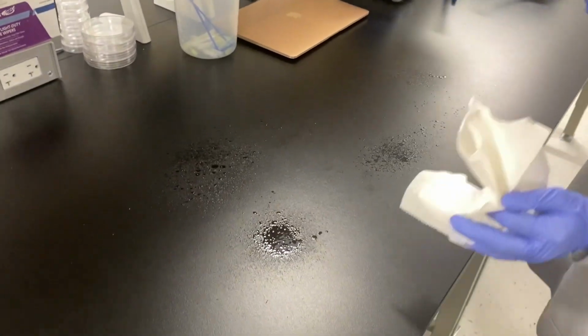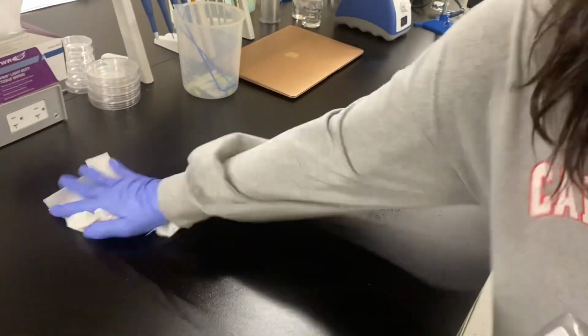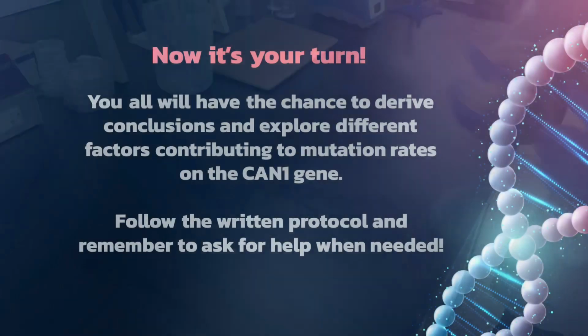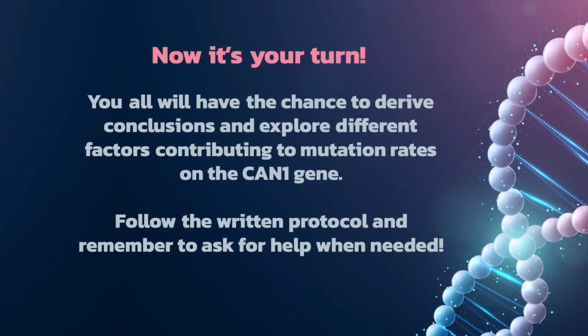Once you finish conducting any of your lab work, it's always important to clean up your lab station for the next person to use. Well done, now it's your turn. If performed successfully, you'll be able to make observations about mutation rates, derive conclusions, and explore different factors contributing to mutation rates on the CAN1 gene. Follow the written protocol and remember to ask for help when needed.